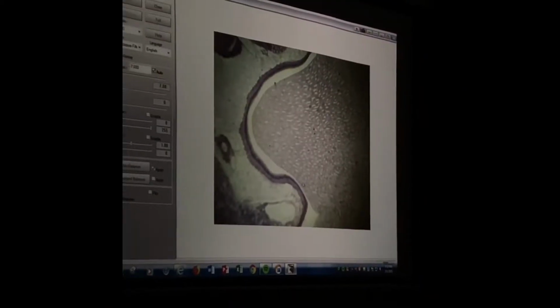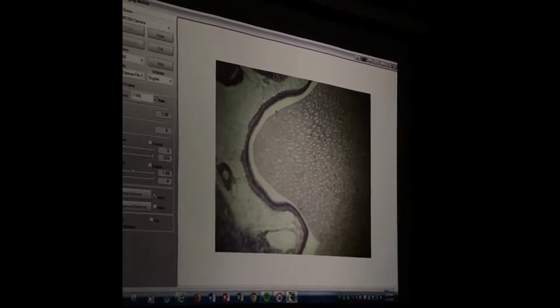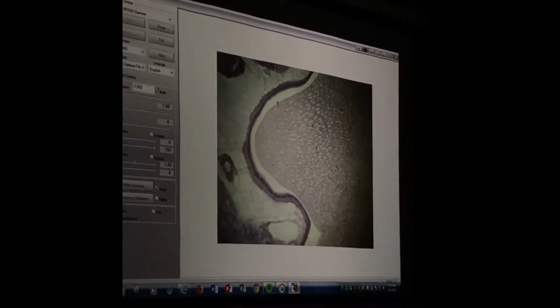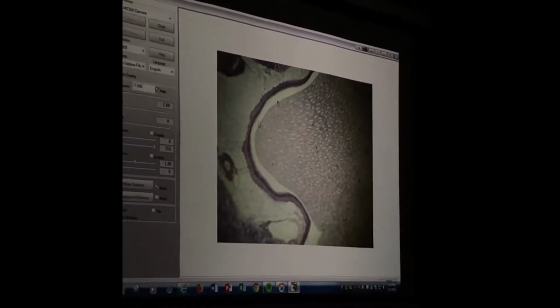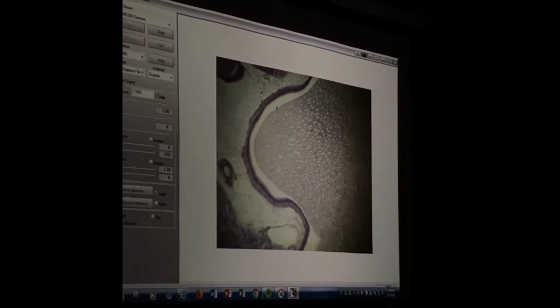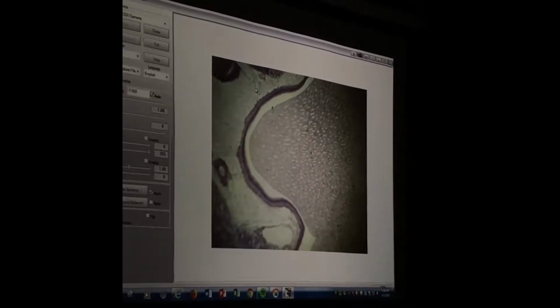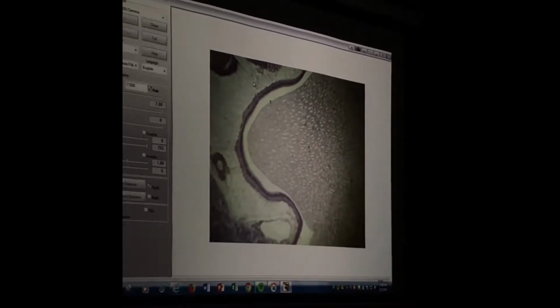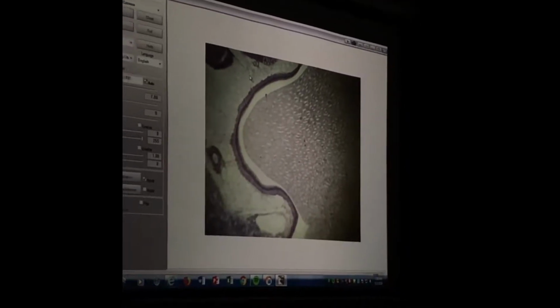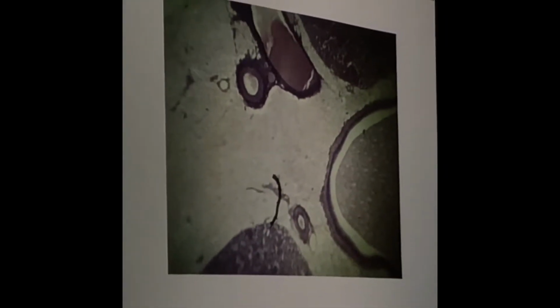So here would be the papilla of the pyramid in the medulla, right here, right? The urine will leave here, it'll go into the space, and remember, the space is created by the pelvis. And when we did the dissection of the gross kidney, remember, it was kind of like an envelope there, right? With an opening at the bottom for the ureter. Sometimes when we look at this, here's kind of where that's coming out at the hilus or hilum of the kidney. So here's where the indentation would be.